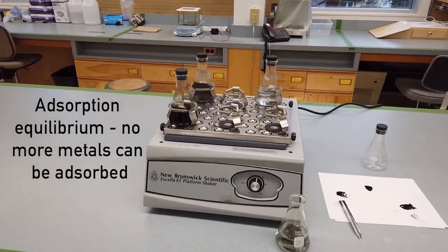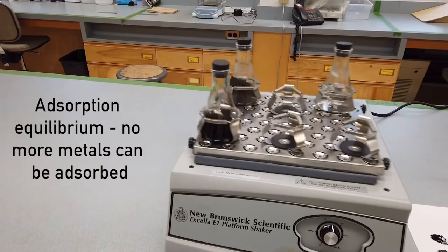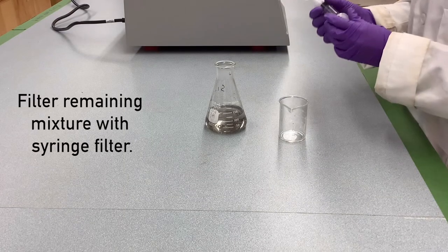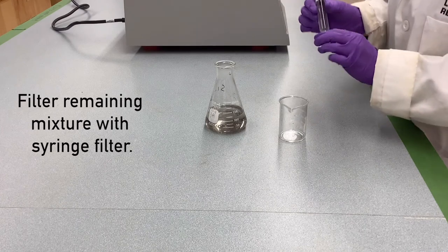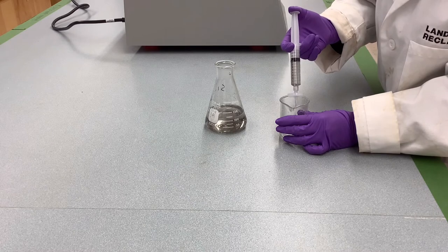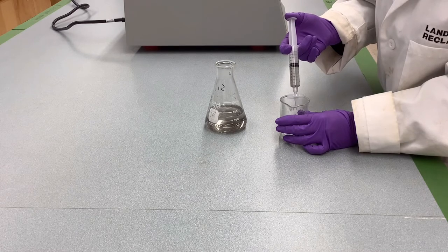This is when no more heavy metals can be adsorbed or attached to the material. Now, we filter the remaining mixture using a syringe filter. This removes all the remaining adsorbent particles from the liquid samples, as they might interfere with my following measurements.